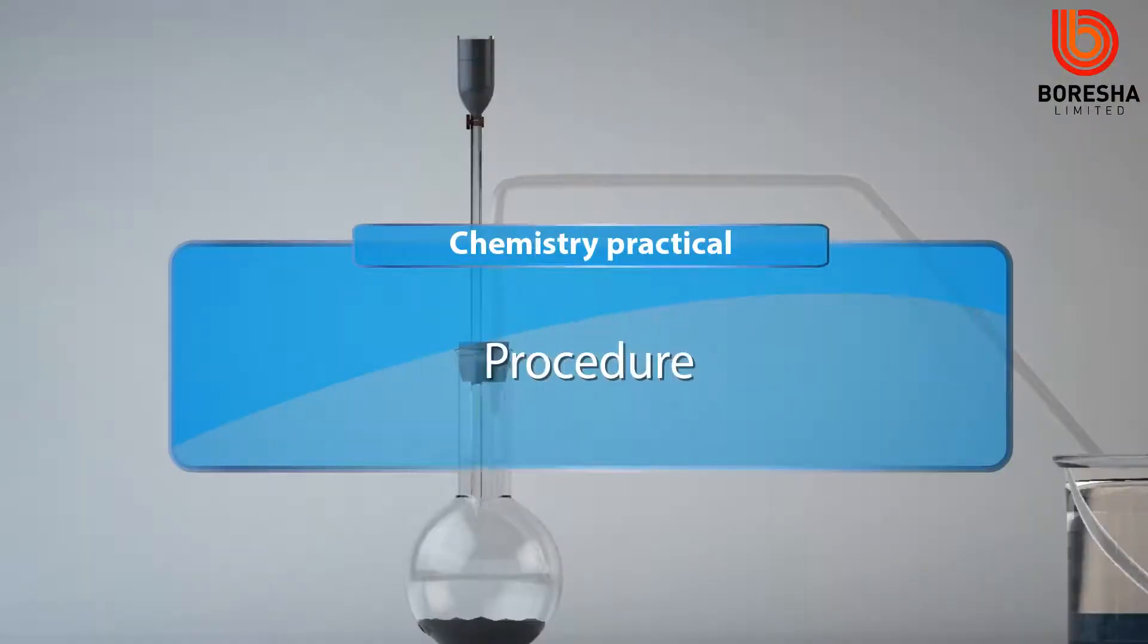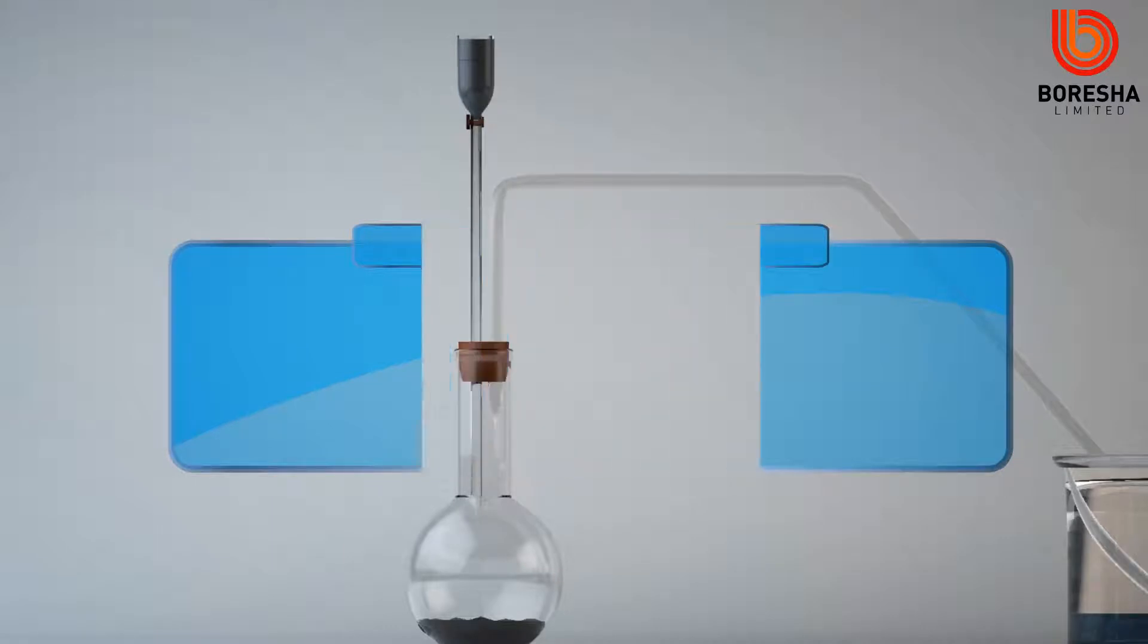Procedure: Open the tap to allow hydrogen peroxide into the flask containing manganese 4-oxide.